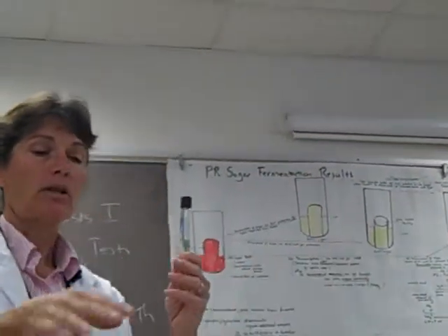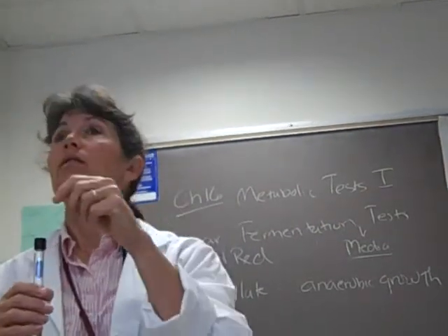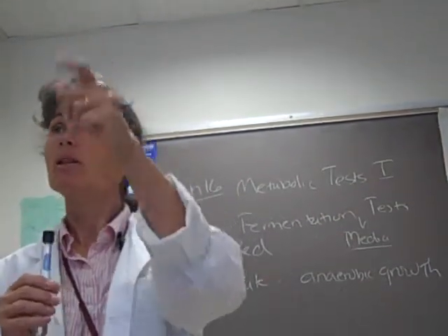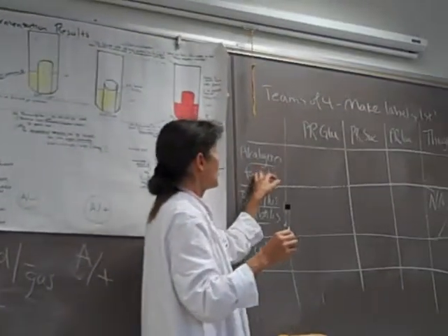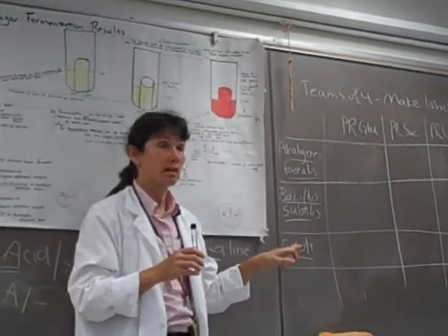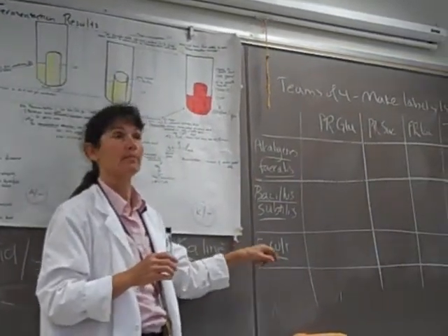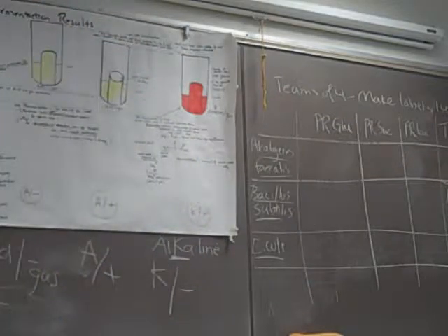You're going to transfer all of your tubes into your well-labeled cans, and they'll go in the 37°C incubator, the middle one here. So the thioglycolates, you'll inoculate Alkaligenes faecalis into a thioglycolate, and in a separate thioglycolate, you'll inoculate E. coli. Those are the transfers you'll be performing today.